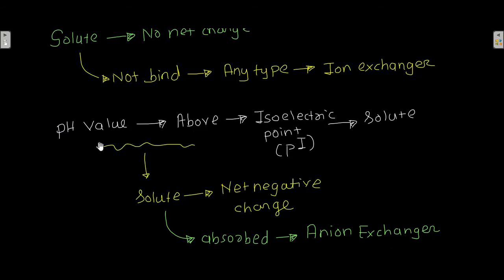Now if the pH value is above the isoelectric point, then that solute will have a net negative charge and it will be adsorbed on an anion exchanger.